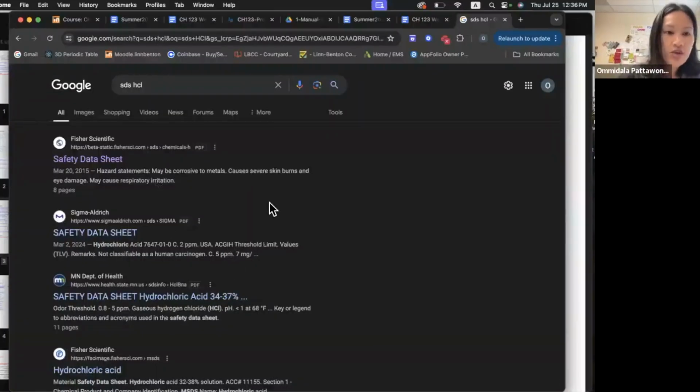Two sites that I like to look up the SDS of a chemical from are, one, Fisher Scientific, and the other one is Sigma Aldrich. It doesn't matter which one it is. It's going to give you exactly identical information. So I'm just going to click on the first one.